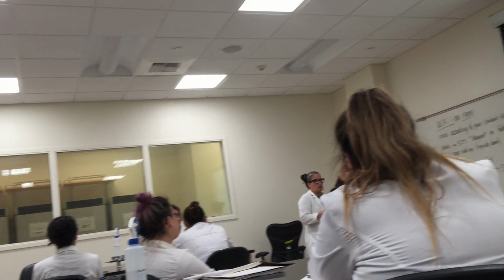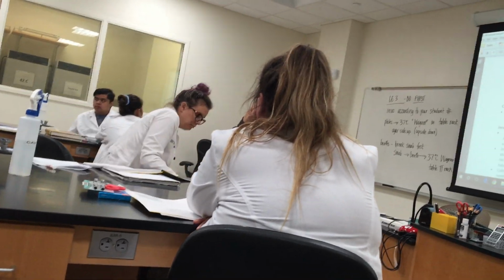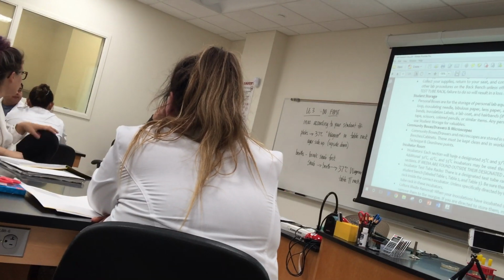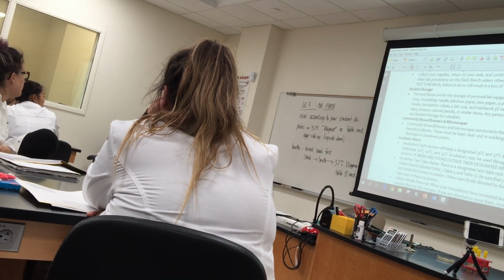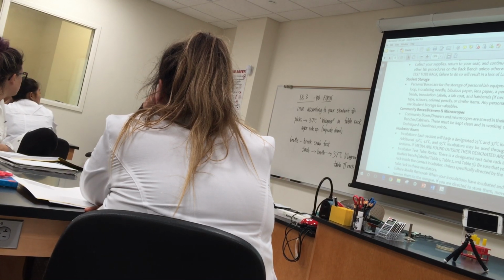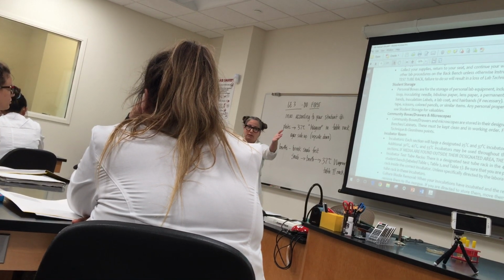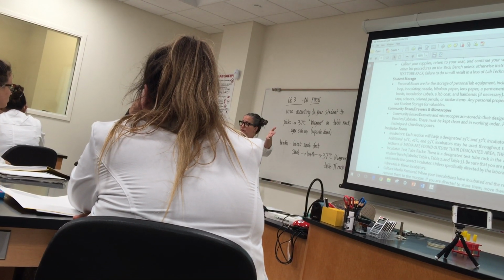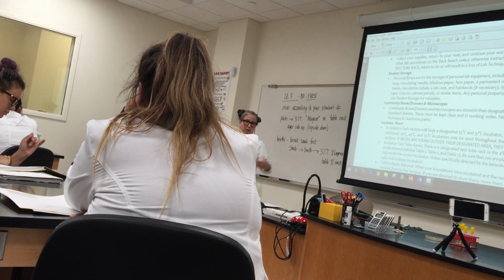Inside of each of those are test tube racks that are labeled table 1, table 2, and table 3. You guys will put your stuff in the one labeled for your table. In addition to that, there are Petri dish racks that are labeled table 1, table 2, table 3. Now imagine, right, there are 24 of you. Each of you today will have 5 broths and 1 plate. That's over 100 tubes. So you can imagine when you come in on Tuesday, if you know you only have to look in one rack, that makes it easier to find your stuff, right? So put your stuff in the appropriate racks, and that just makes it easier for you to find it later rather than you have to sort through everything, right?